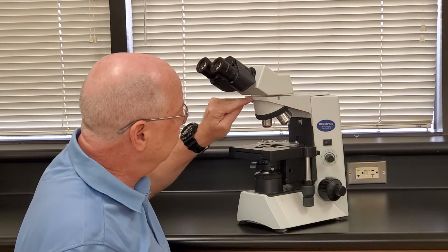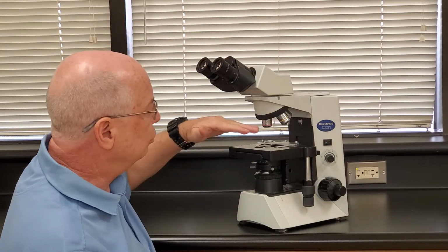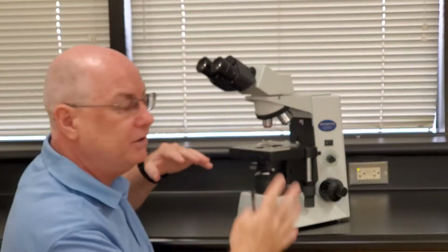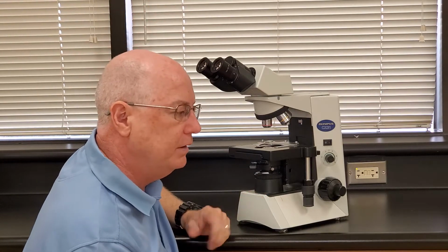And as it goes through here, it goes off a mirror, and then it will be magnified another 10 times. So if this makes it 4 times bigger, and this makes that 10 times bigger, the smallest you will see something, if you look through this microscope, the lowest magnification is going to be 40 times larger. That would be like looking at a 6-foot person who appears 240 feet tall.